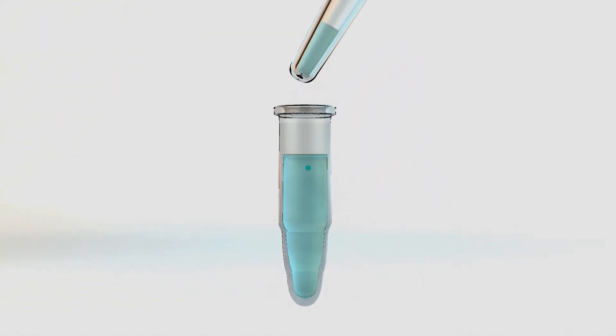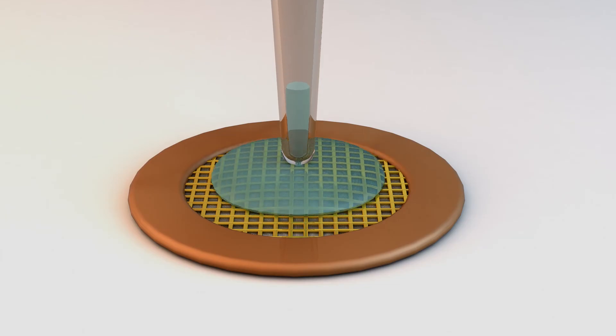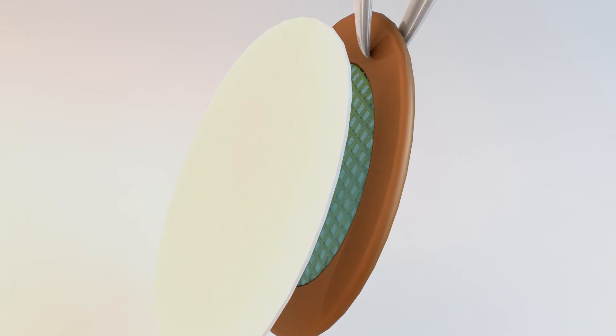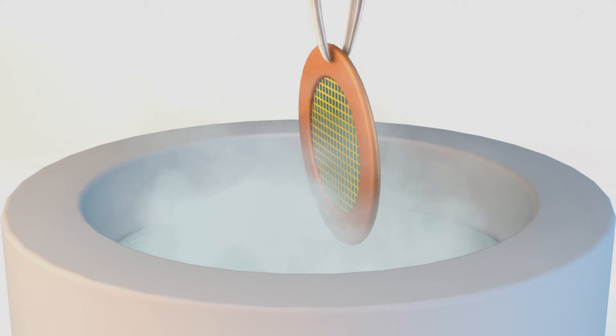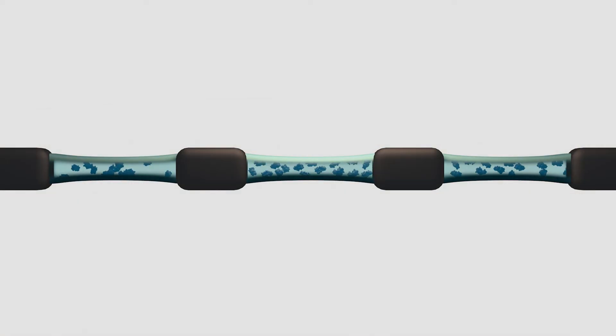Cryoelectron microscopy starts with the preparation of a pure sample of protein in water. The sample is then frozen in liquid ethane so rapidly that ice crystals cannot form and the protein molecules are held in their natural shape in a very thin sheet of ice.